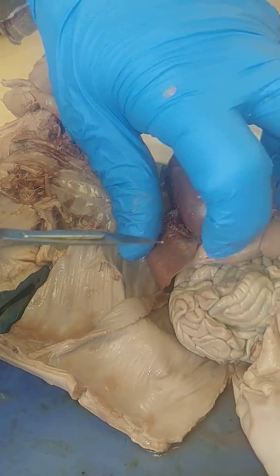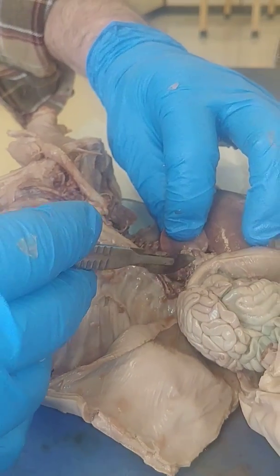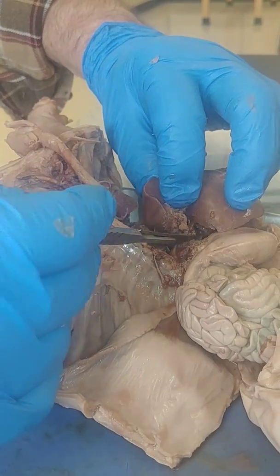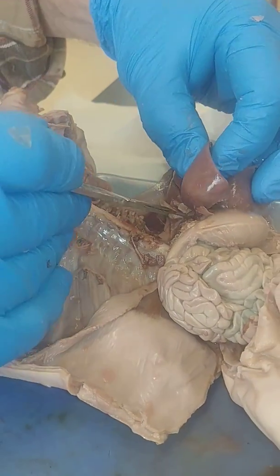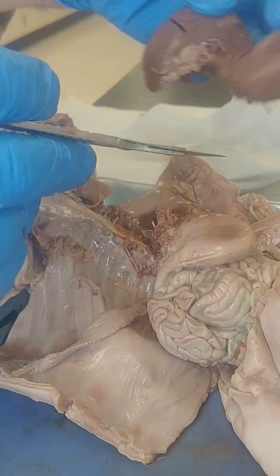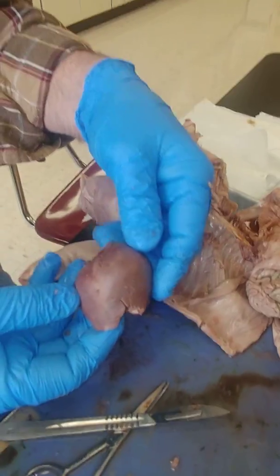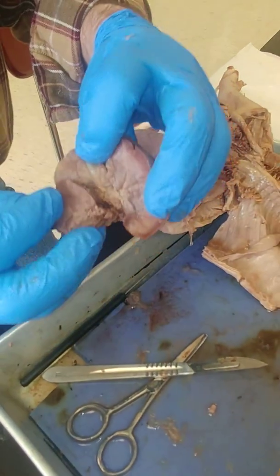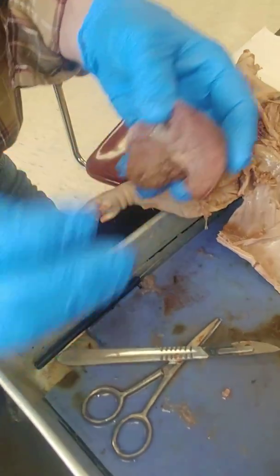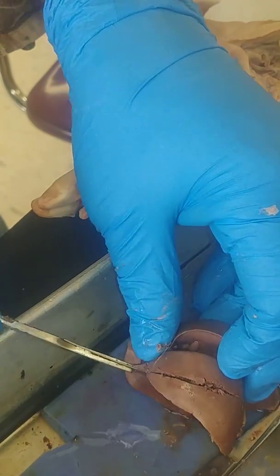So when you have a number of lobes, the liver is split up into sections, but your liver is the largest internal organ of the body. The largest organ of the body is the skin. We're going to trim this out of here. Trying to be careful with that esophagus back there. And so this is the liver. This is the way it would be sitting. Up underneath on the right side, like I said, is the gallbladder right there. Okay, I'll cut a section here, but you'll see this is really a solid structure.